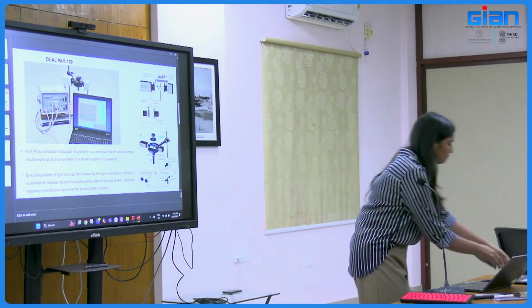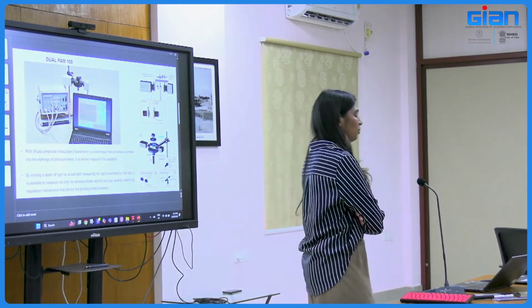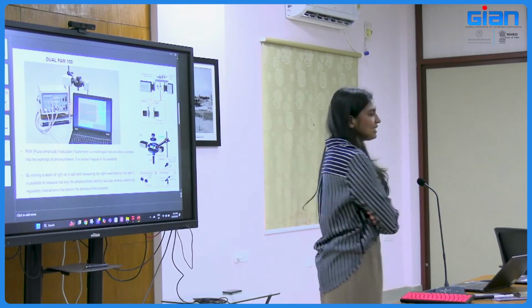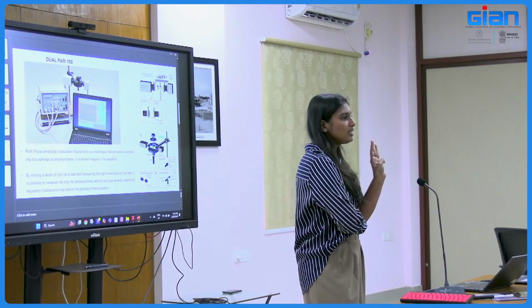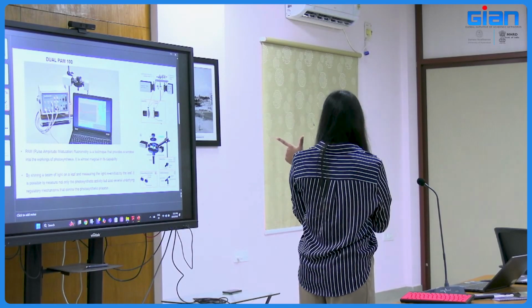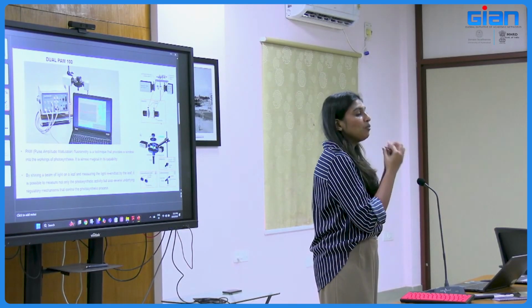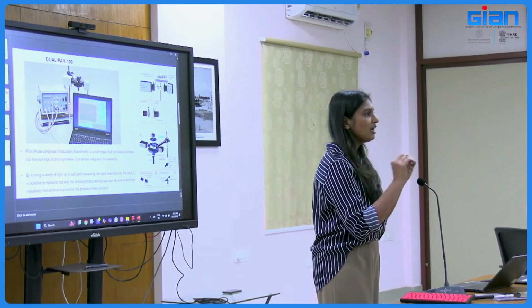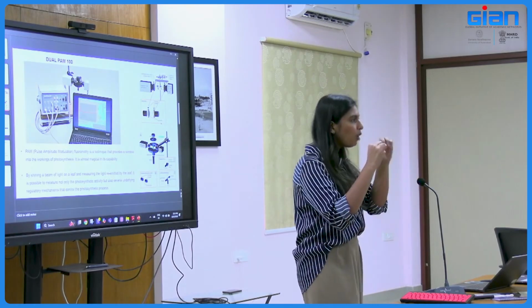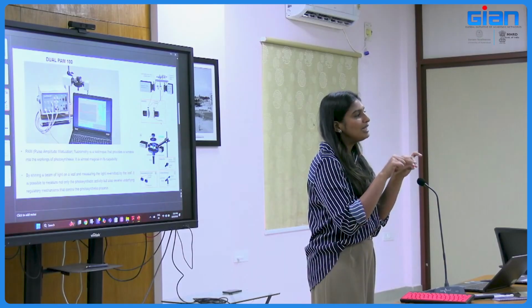Now coming to dual PAM, which is pulse amplitude modulation. Why is it called pulse amplitude modulation fluorometry? Basically there are three light components in dual PAM. One is measuring light, which is the modulated light, a very weak light, like 1 micromole Einstein, but this will be continuously probed. There will be a probe to emit the light. So this emitted light will be pulse amplitude modulated.